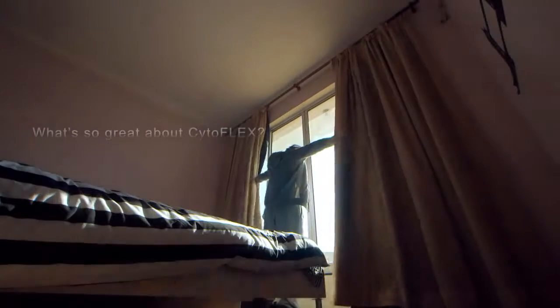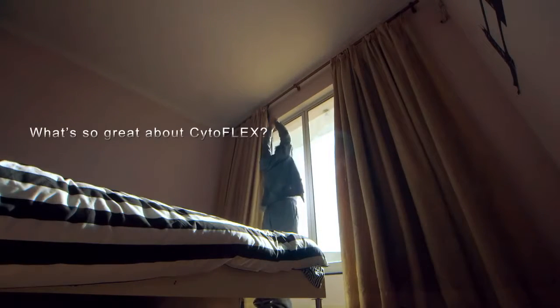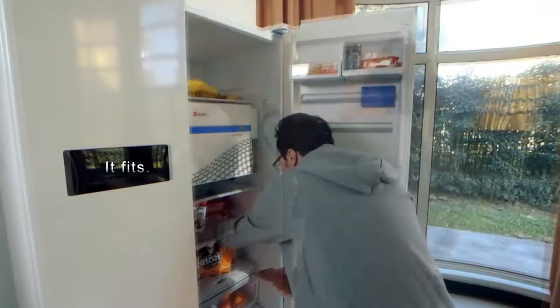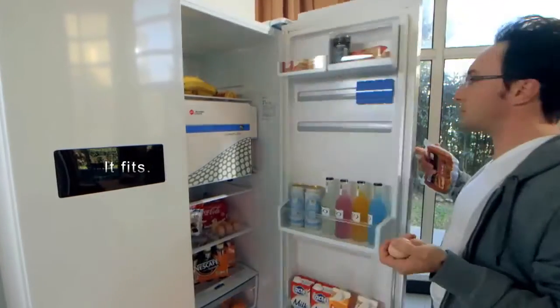What's the first thing you notice about the new CytoFLEX Flow Cytometer from Beckman Coulter? It's surprisingly small, just 40 by 40 centimeters.